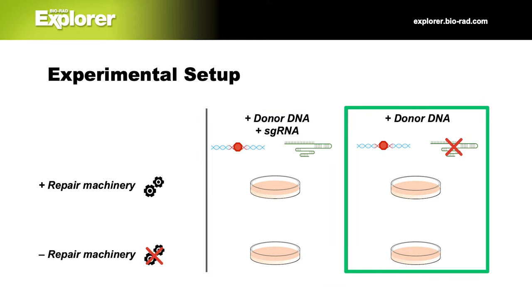Use a new loop and take 5 colonies from your starter plate without arabinose. Add the colonies to tube B and swirl your loop around to break up any clumps. Once the bacteria are dispersed, put the tube back on ice.